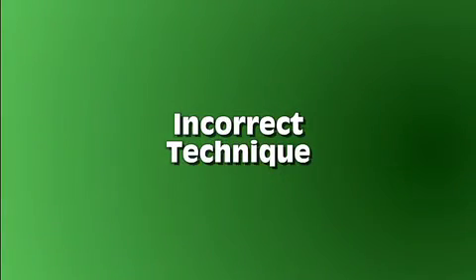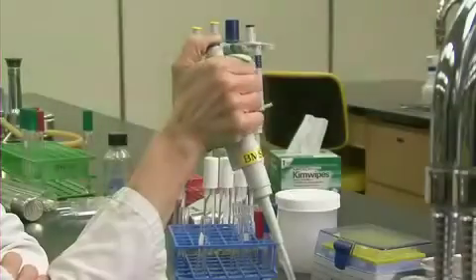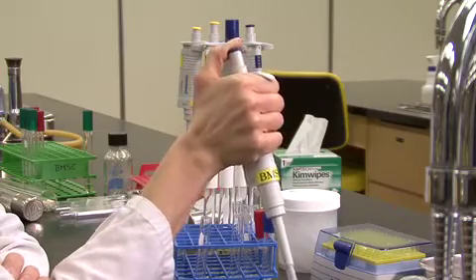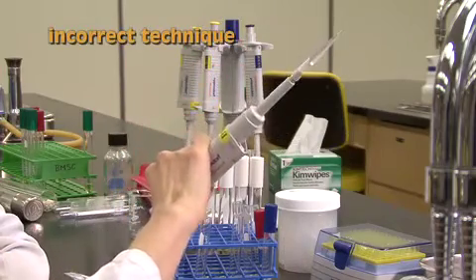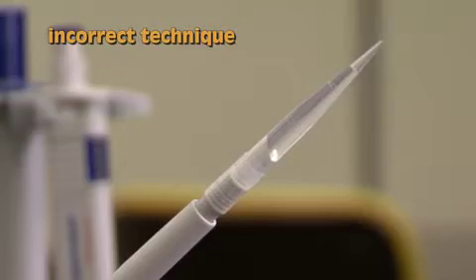To complete this demonstration of liquid handling, here are a few commonly made mistakes that should be avoided. Always ensure that a full pipette or micropipette is kept vertical, so that the liquid does not run back into and contaminate the device.